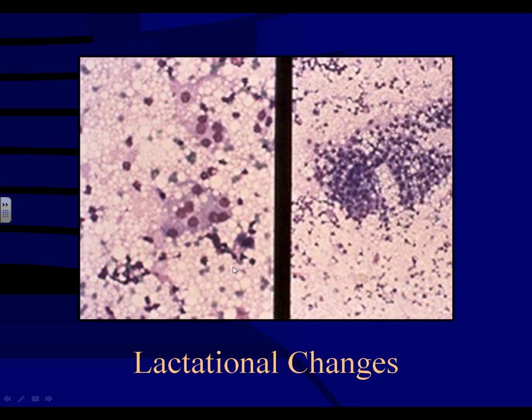You're still going to see myoepithelial cells in the background, the darker smaller ones — a good feature supporting benignancy. Because of the looseness of these groups, lactational change can be a potential pitfall for breast cancer. But a breast cancer is going to have much more cellular anaplasia, many more individual cells, very high N/C ratio, and not this amount of cytoplasm.